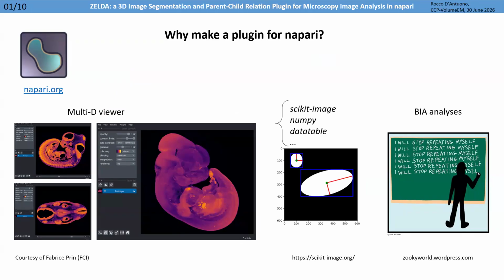I started using Napari because of its capability to show data in a multidimensional way. Indeed, if one has an ND dataset, one can easily show reslices of volumes, or explore the data in a temporal dimension, and also visualize a more complex experiment.